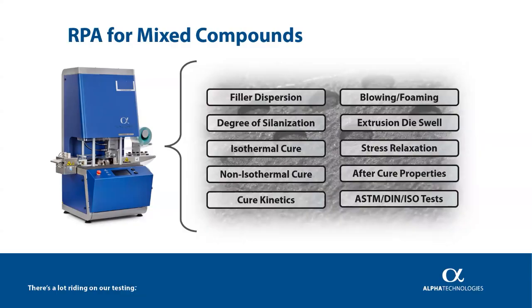Stress relaxation testing is possible as well, along with after-cure property evaluation. And of course, the RPA, again, can be used to perform all the standard tests defined by ASTM, DIN, and ISO.